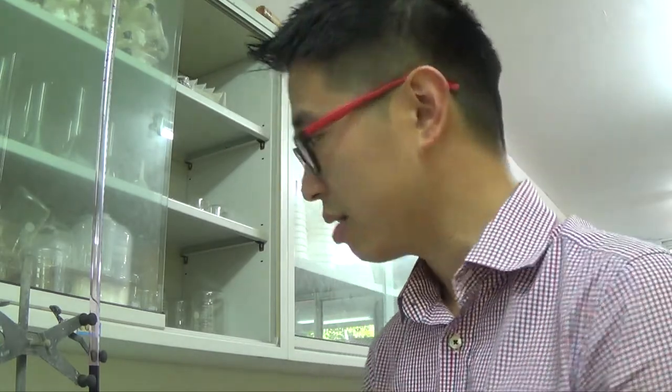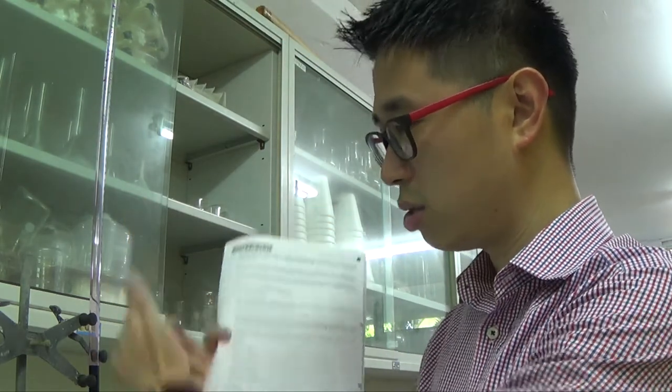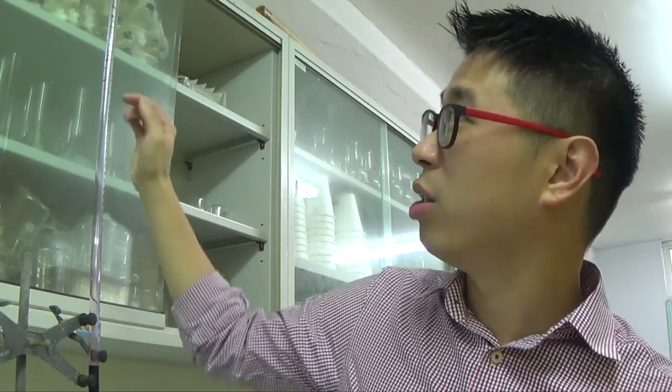So that's it. I've just done two exact titrations, and that is enough because I did one rough in order to know roughly where I need to stop. I took away like 3 or 4 cm cubed, depending on what initial volume I started with, which is not necessarily always 0.00 or a whole number. Then I'll be careful. I don't need to add drop by drop until near to the end point for the first accurate titer, and for the first accurate titer, I already know exactly where to stop. Therefore, for the second accurate titer, I do not need to go minus 5 cm cubed. I can just do minus 1 cm cubed from the expected endpoint so that I don't have to waste too much time. Again, drop by drop towards the end, and you can get the endpoint pretty accurately.